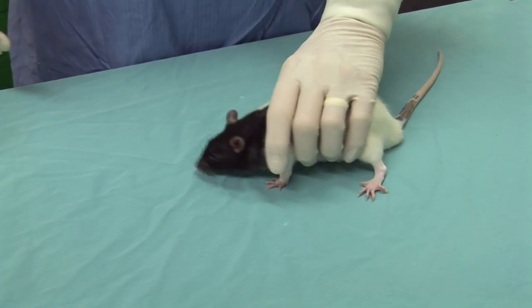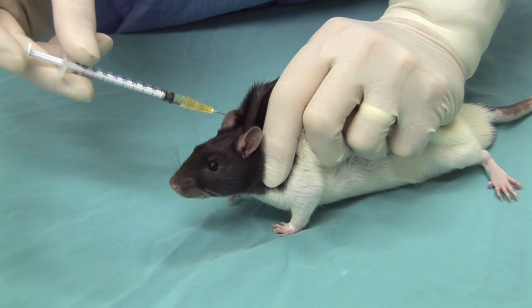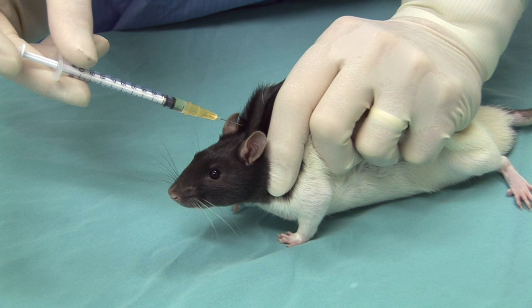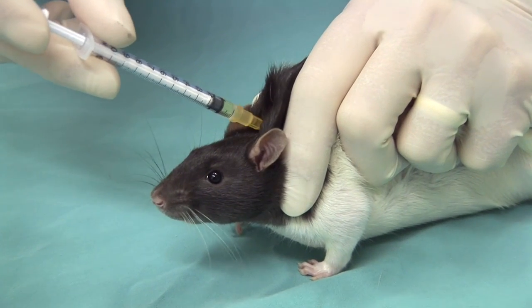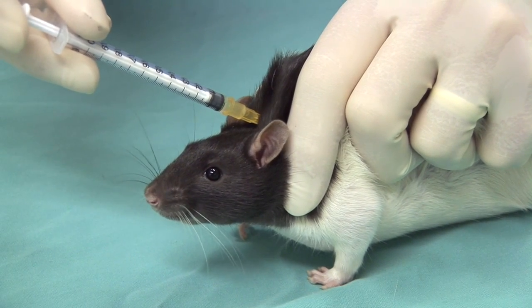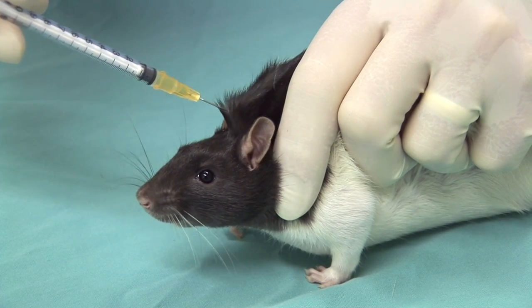An alternative approach is to inject into the loose skin overlying the neck. The rat is grasped around the shoulders and chest and the loose skin overlying this area is tented. Once again, the needle should be directed into the base of the tented skin so that inadvertent injury to your fingers with the needle is avoided.